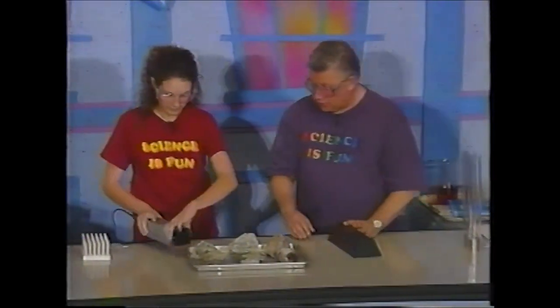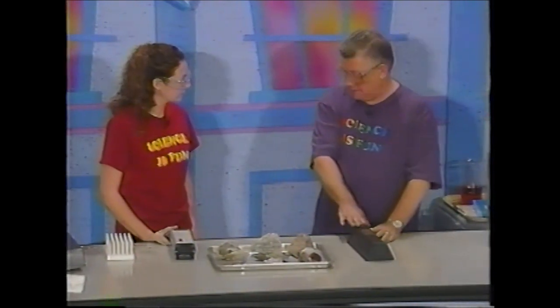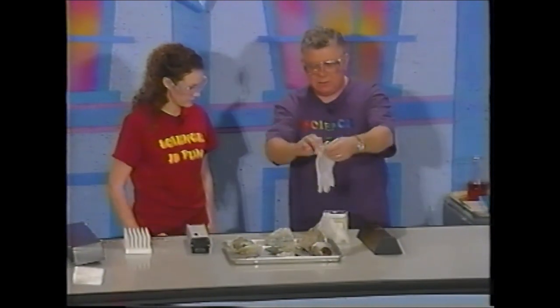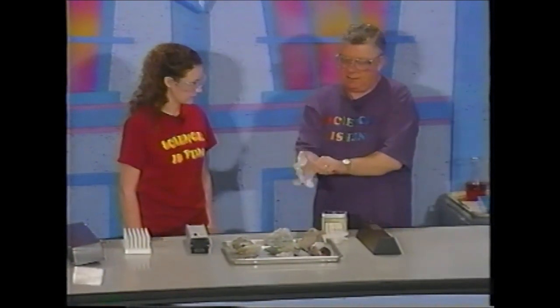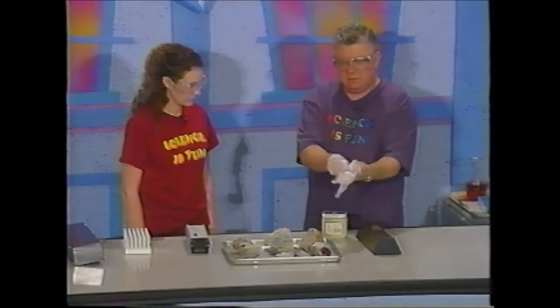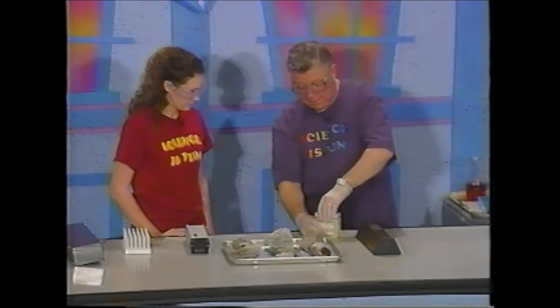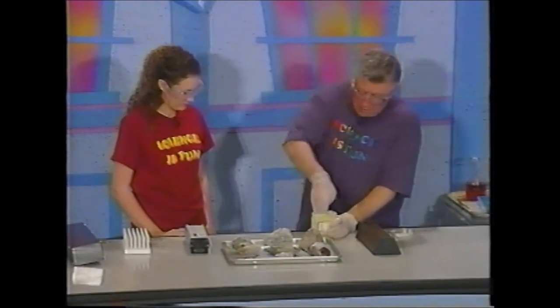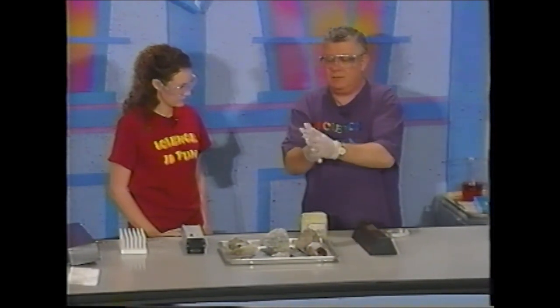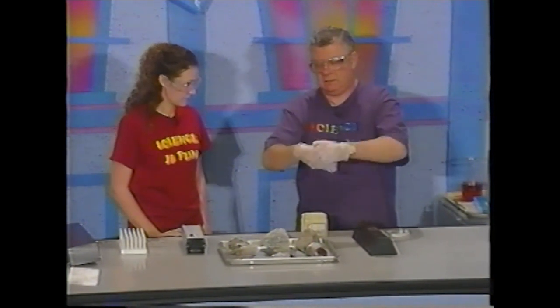And I'd like to show you another experiment using a black light. Okay. To do that, I'm going to have to put some gloves on. So I'll do that quickly, because the next thing I'm going to do is put some Vaseline on my hands. And you know what that does? It makes them all very sticky. So I'm going to take a big glob of Vaseline like this, all right? I'm going to rub it in like so. Do you see anything different about my gloves?